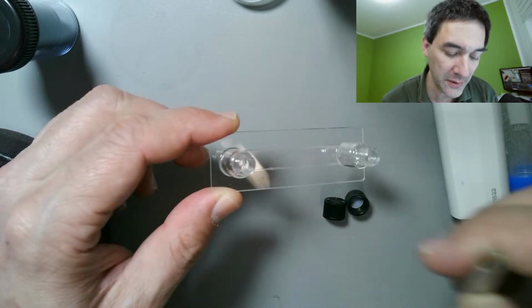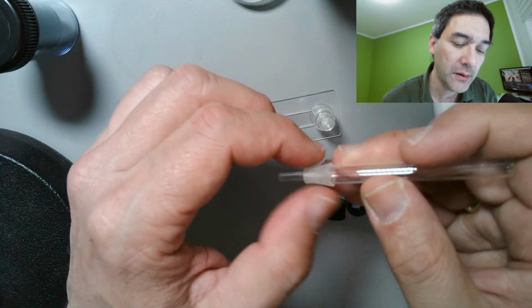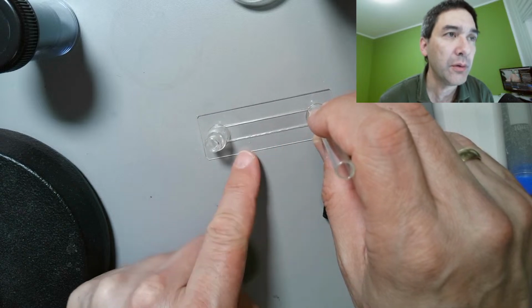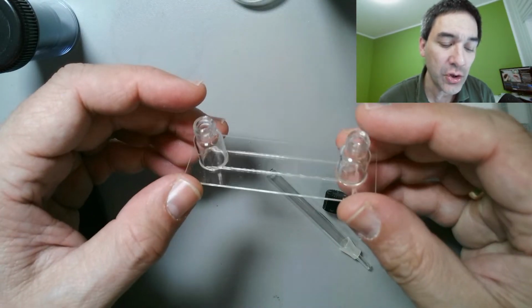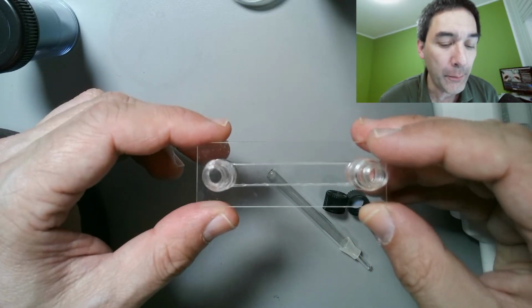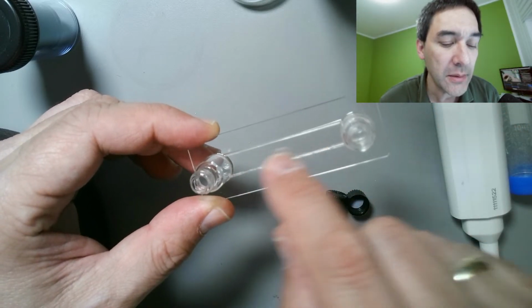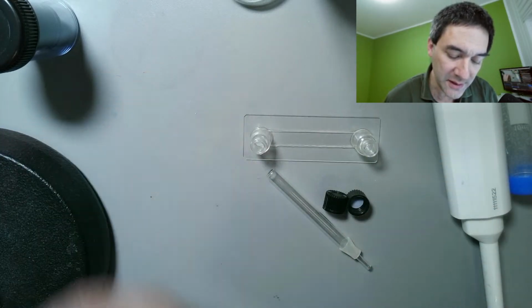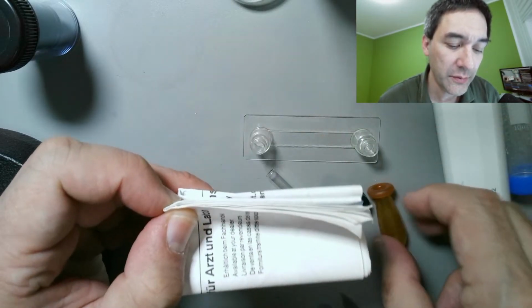And then you can also use a pipette, you see there's a rubber cone here, and you can push the liquid through the whole thing, also for cleaning. So yes, this does exist. A disadvantage, I think, is that it is kind of delicate, and I wonder if it is not somehow possible to make something similar yourself, maybe using some kind of a large cover glass or so. I don't know. But indeed, this does exist. I think there's something else in here, right? Here it is, this one over here, and including, of course, an instruction.